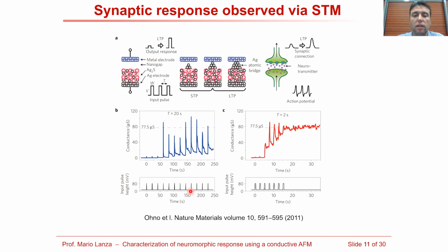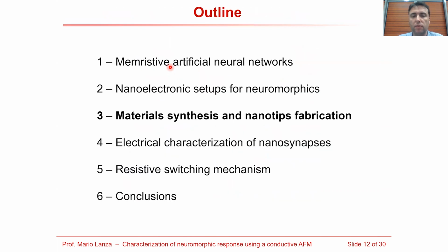This was done and some relaxation and some potentiation was successfully demonstrated. However, in this setup, there is a big problem: between the metallic tip, which serves as electrode, and the material and bottom electrode, there is a nano gap, which doesn't meet the real conditions of devices. So what we are doing in my group is to use a conductive atomic force microscope instead of the scanning tunneling microscope, because in a conductive atomic force microscope, there is no nano gap between the tip and the sample.